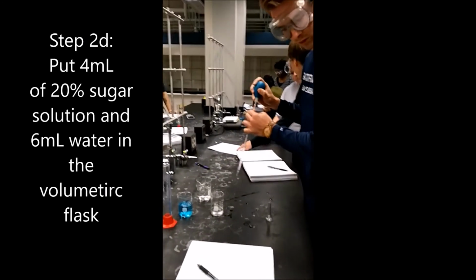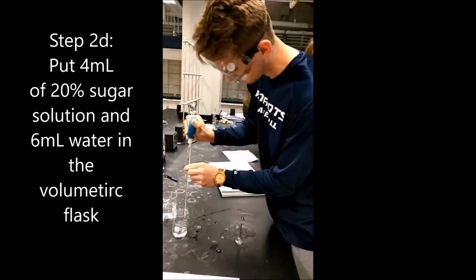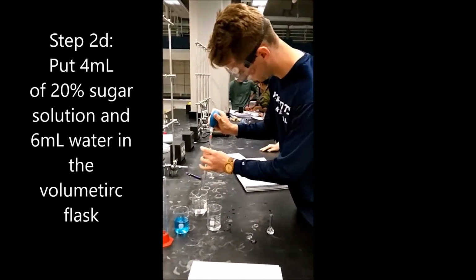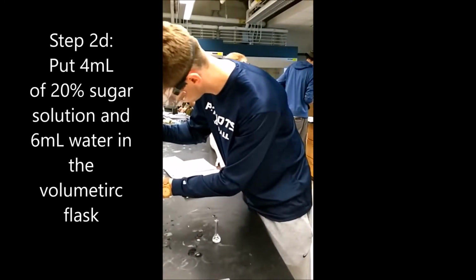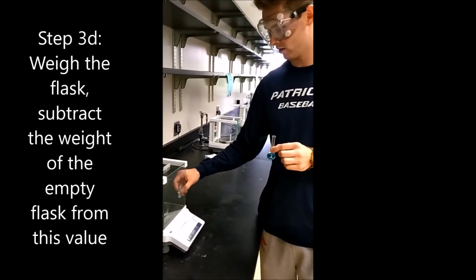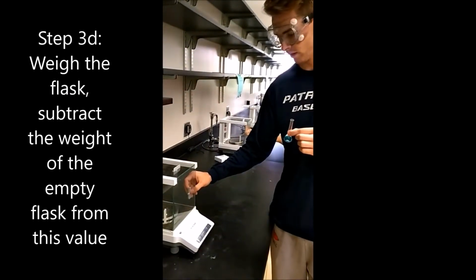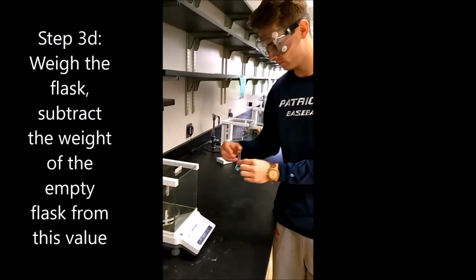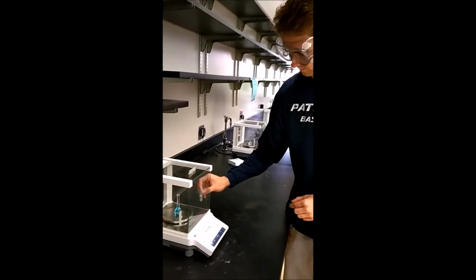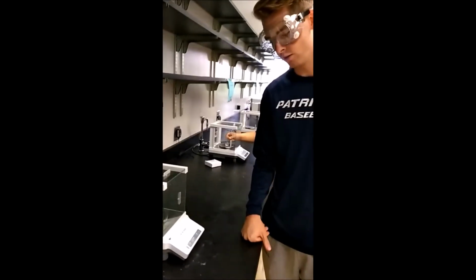Add in the 4 milliliters of sugar solution. Going to weigh the 4 milliliters of 20% sugar solution and 6 milliliters of water. Weight is 19.908 grams.